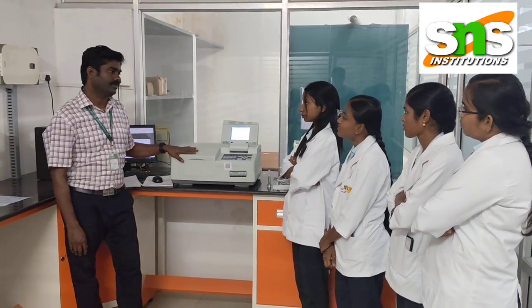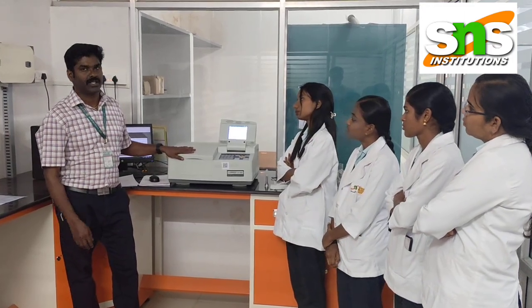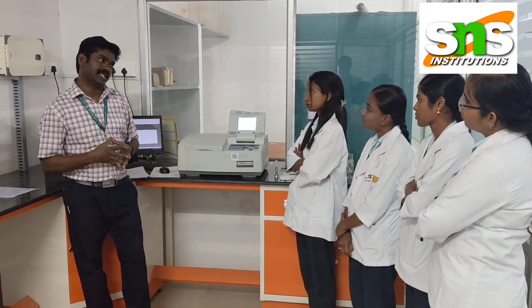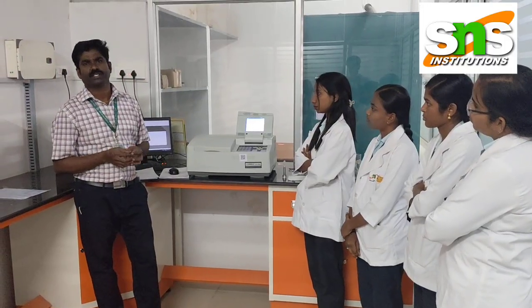What are sample cells made of? The sample cell is made with quartz material, and we can use glass and plastic also as a sample cell.